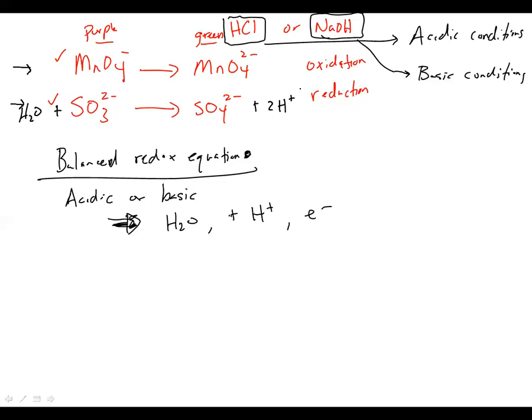So what you'll see is they added a couple of drops of sodium hydroxide, or they added a couple of drops of HCl into the reaction mixture. And again, really, for most of the purpose here, you'll be able to figure out that tells you it's acidic conditions or basic conditions. And that's going to be really important when you go to balance these redox reactions.